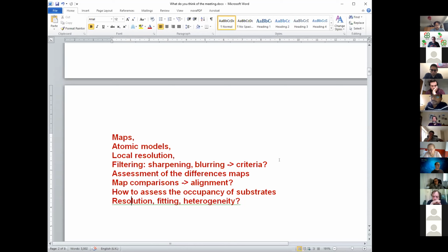It's quite an important complex, with 20 different proteins, 20 different chains, all of them 70 and 60% out of the densities. If it is a problem of origin only, that's a matter of shift, and there's a straightforward formula to correct both.